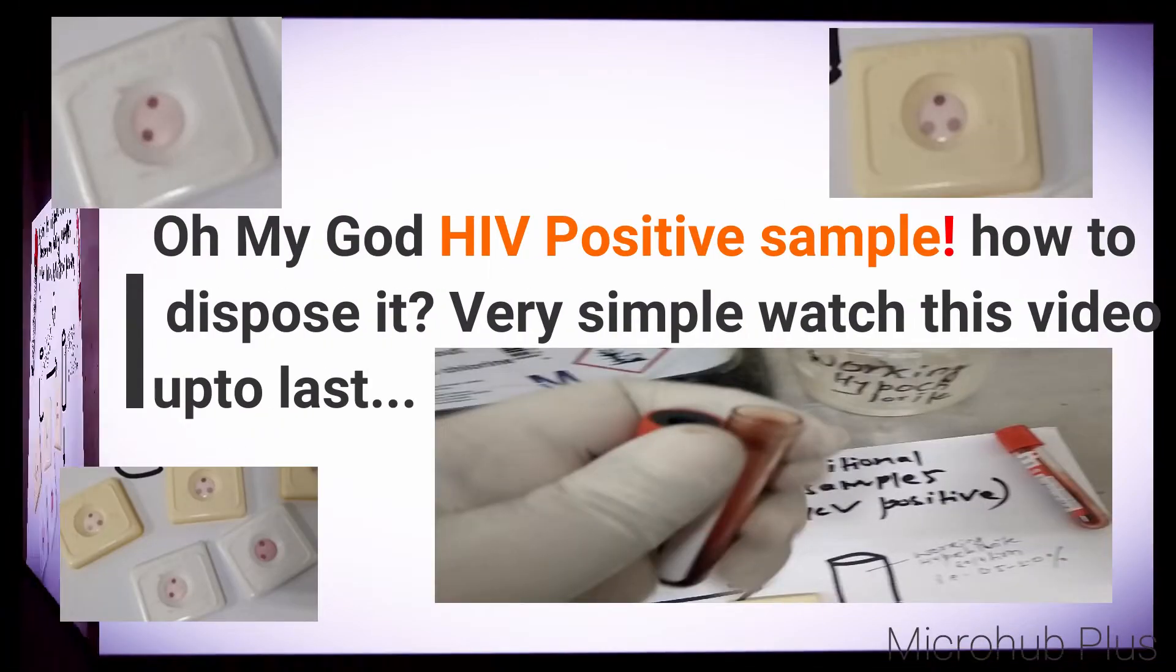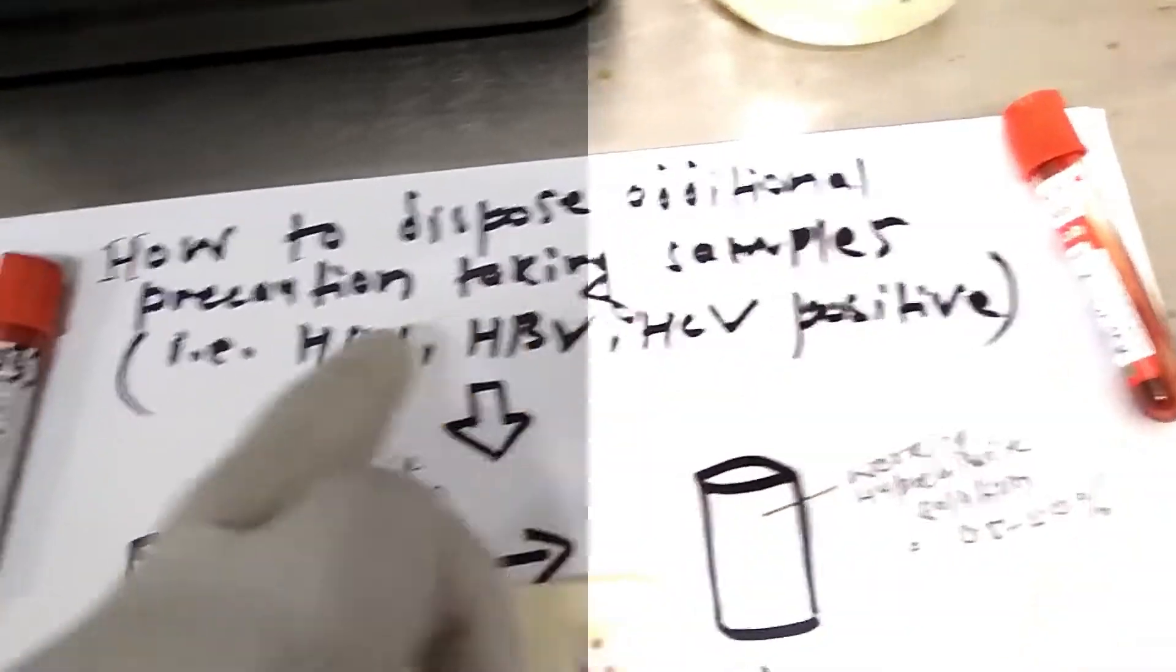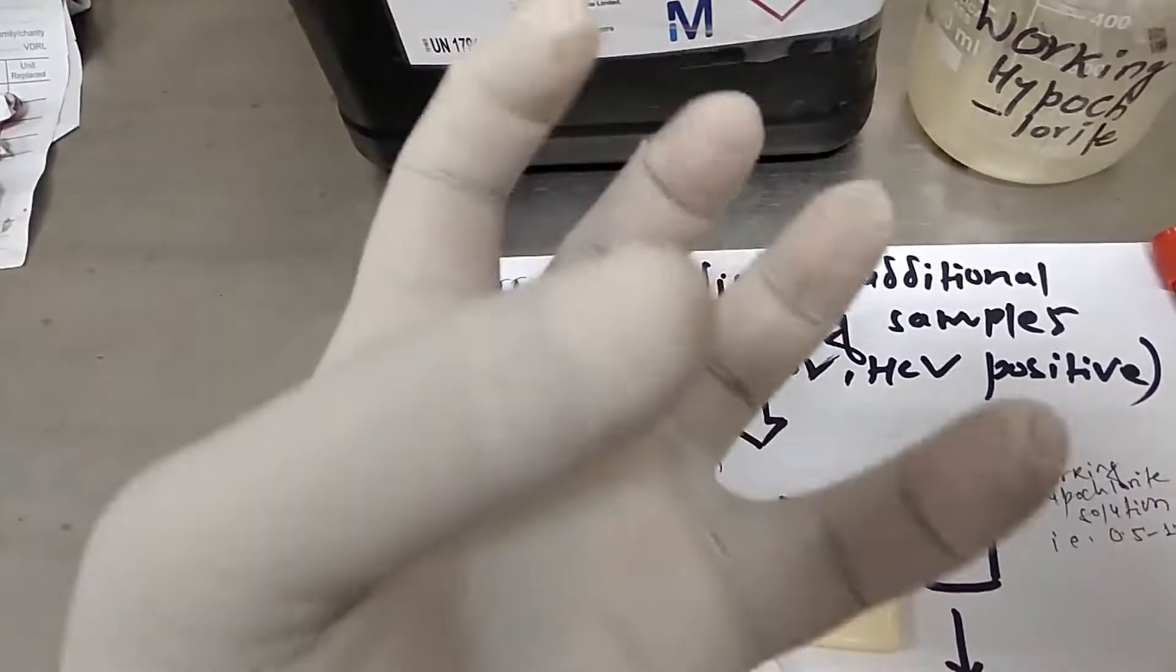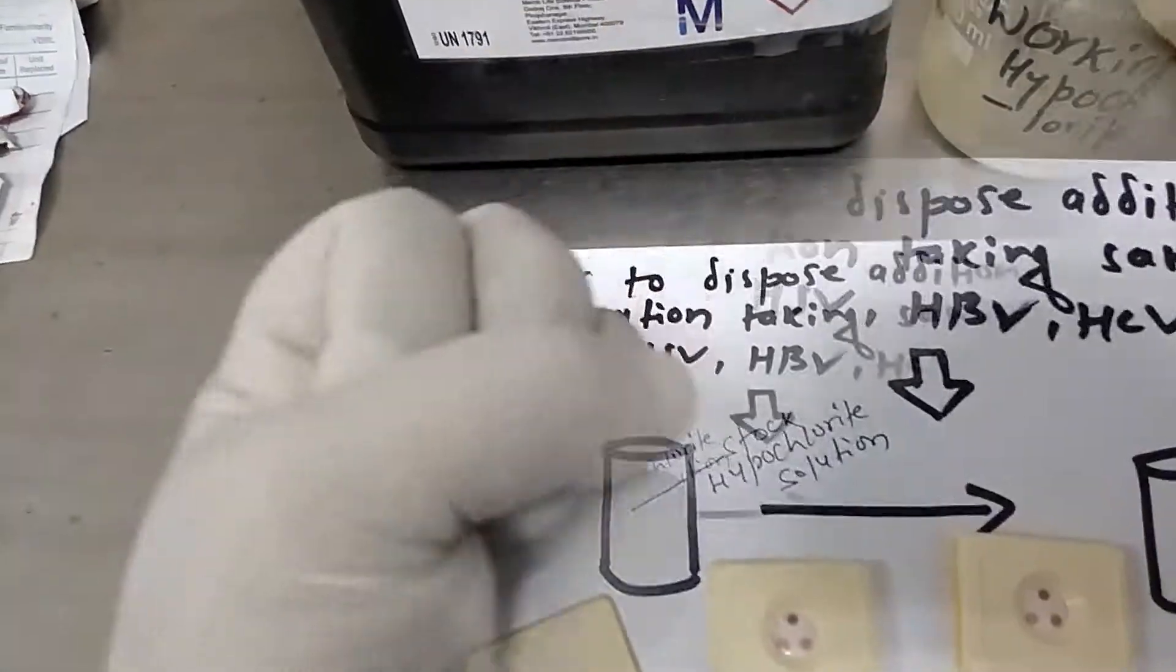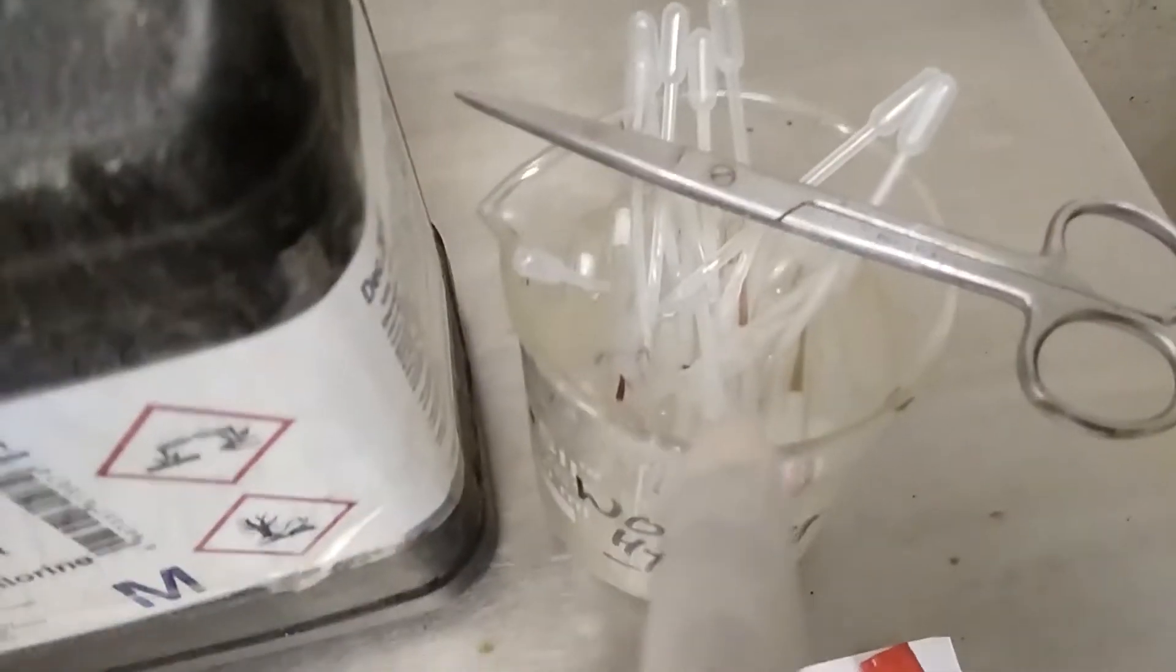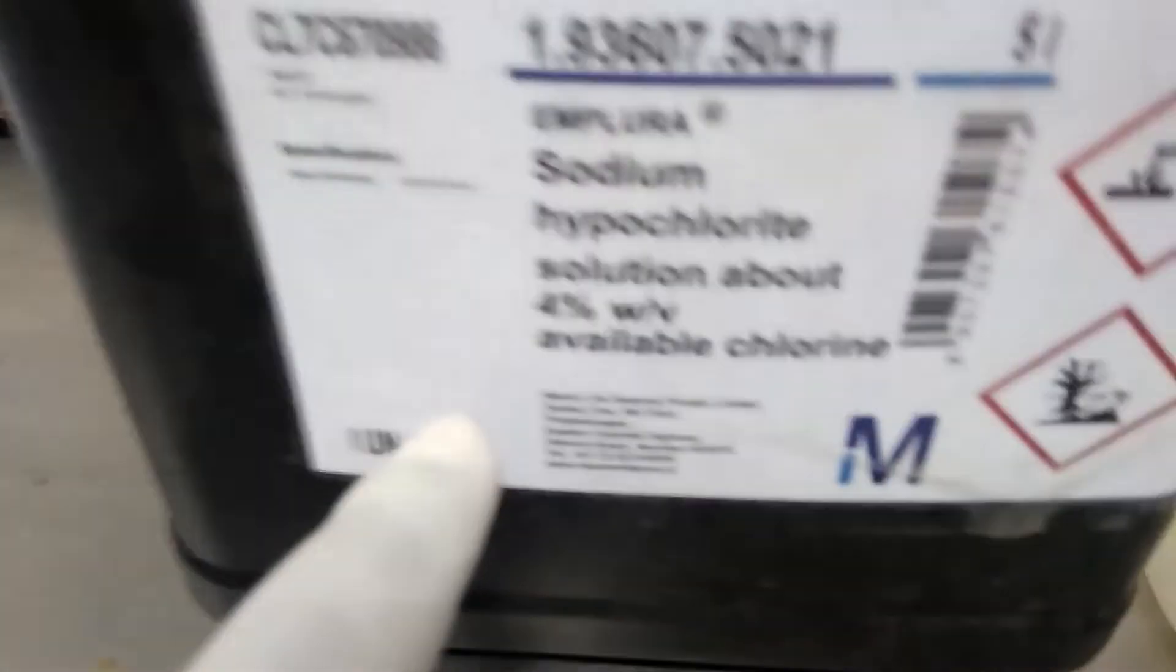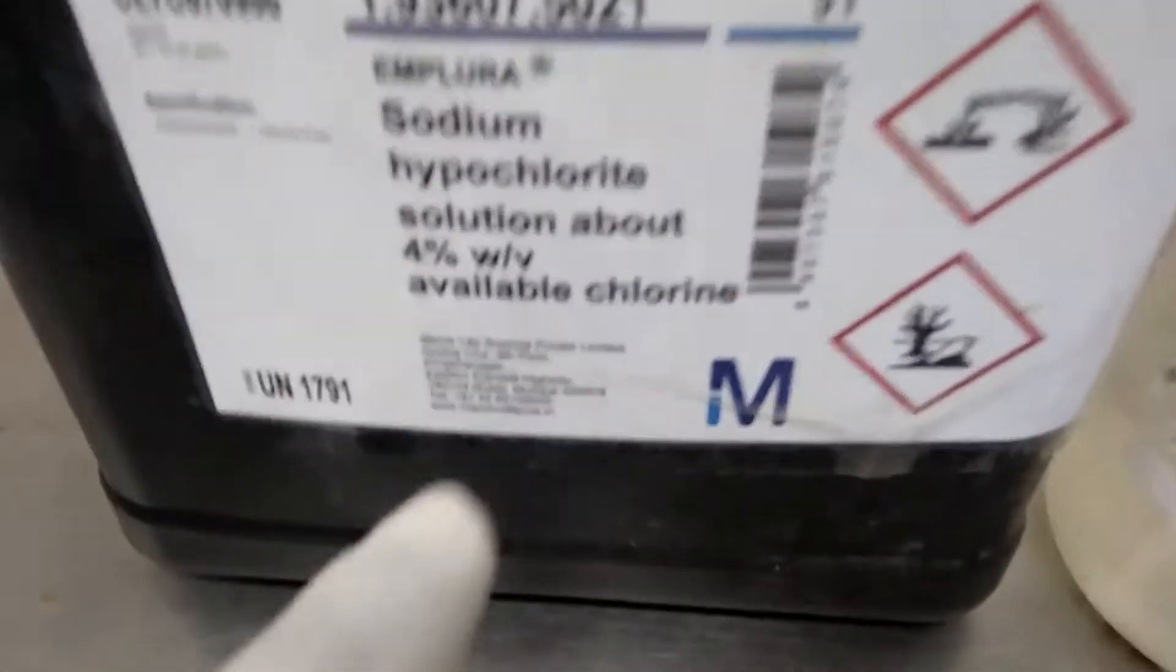Hello everyone, today we are concerned with how to dispose additional precaution taking samples - that is HIV, hepatitis B virus, hepatitis C virus positive samples. Don't worry about it because every laboratory has concentrated sodium hypochlorite solution. Wear gloves and first prepare 0.5% working sodium hypochlorite solution. Link given in description. So now we can see here.